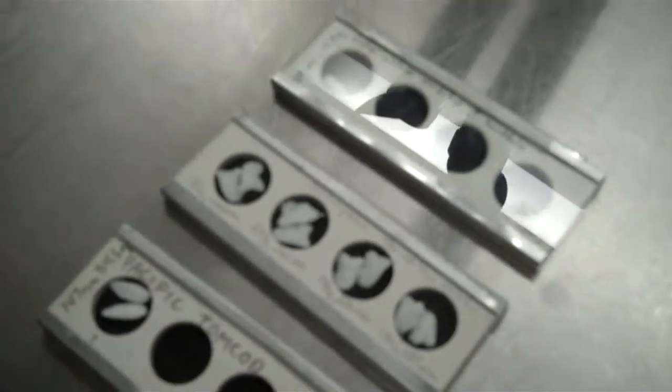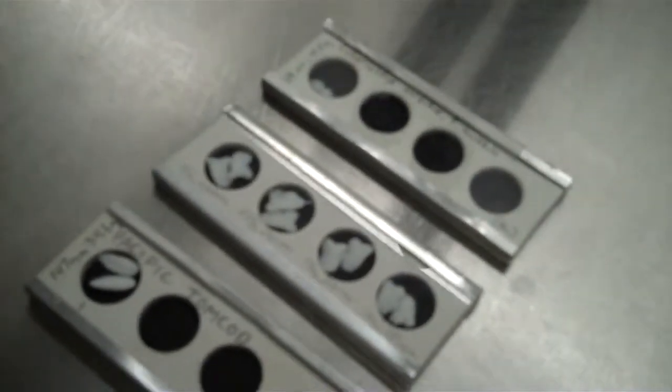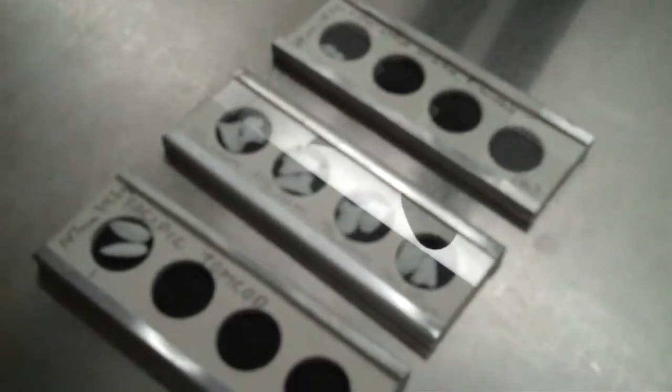Identifying otoliths is a challenging process because the otoliths we look at have been through the digestive system of a Brant's Cormorant and have been exposed to the elements before they come into our lab, so they're usually highly eroded. I hope you've enjoyed the process of pellet dissection.